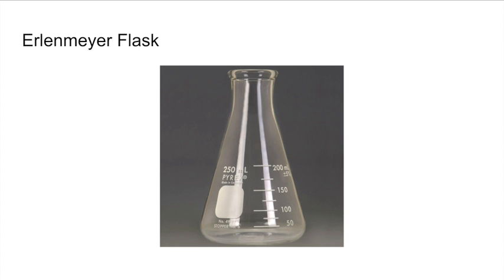Such features similarly make the flask suitable for boiling liquids. Hot vapor condenses on the upper section of the Erlenmeyer flask, reducing solvent loss. Erlenmeyer flask narrow necks can also support filter funnels. The final 2 attributes of Erlenmeyer flasks make them especially appropriate for recrystallization. Like beakers, Erlenmeyer flasks are not normally suitable for accurate volumetric measurements. Their stamped volumes are approximate within about 5% accuracy.